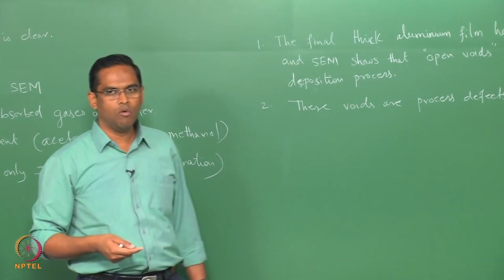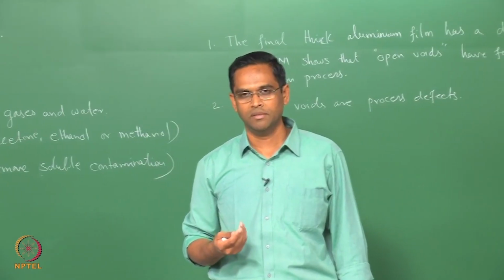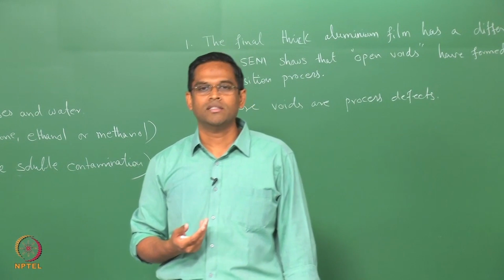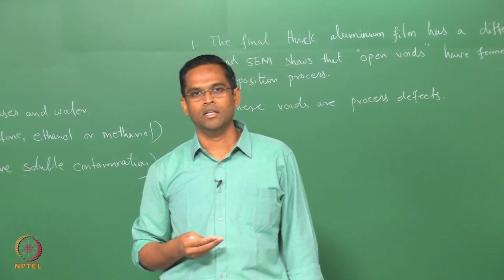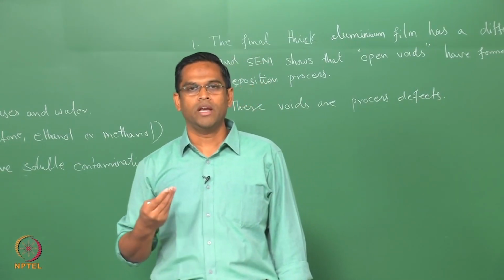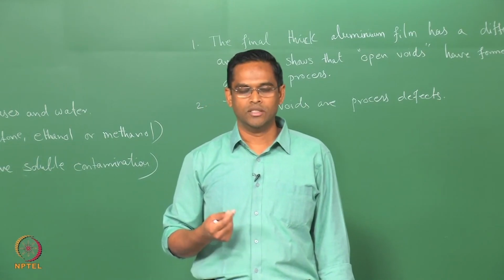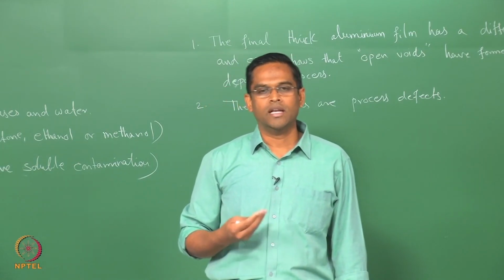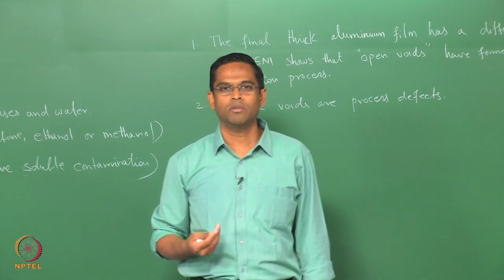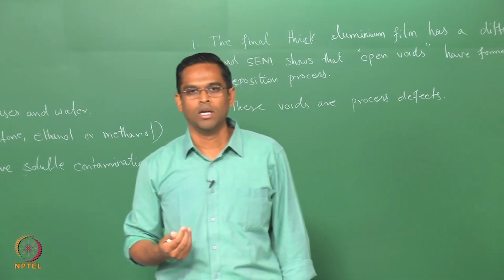So, I will now move on to the other important use of this SEM in this case study called microanalysis. The microanalysis can be done in 2 or 3 methods depending upon the detection capability. One of the very common uses of microanalysis is by energy dispersive spectroscopy, or spectrometer, which is an attachment to an SEM or a TEM and so on.